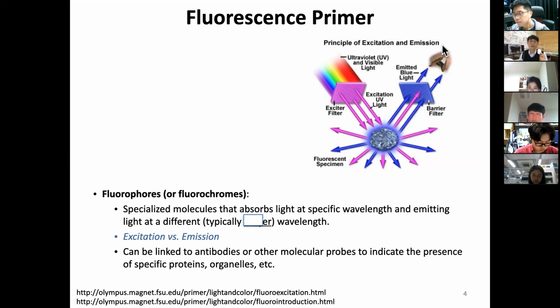So can you imagine what happens if you are looking through this? Except for this stone, the rest of the light will be blocked, so the background will be completely black. And the interesting light, which looks like a blue light, passes through.